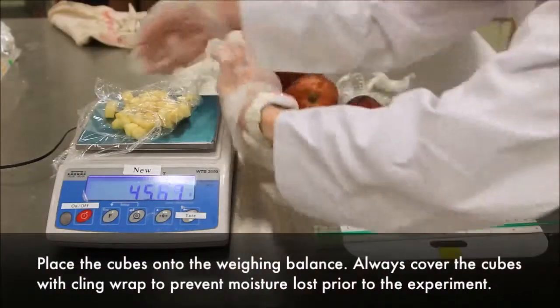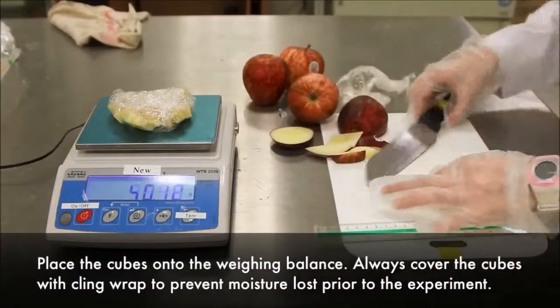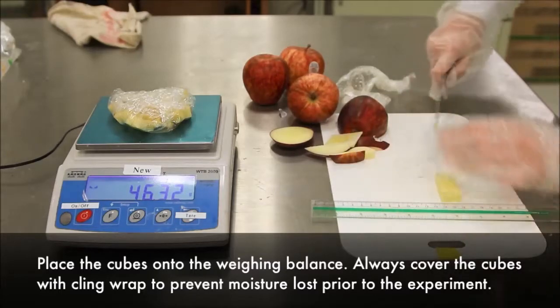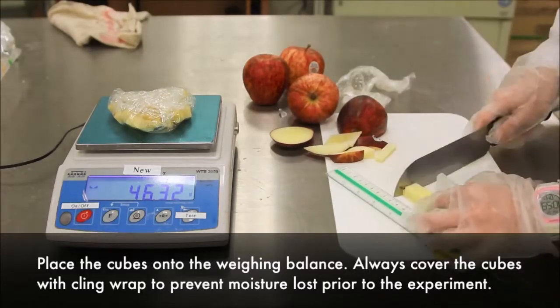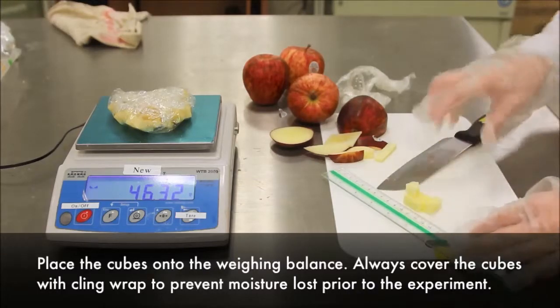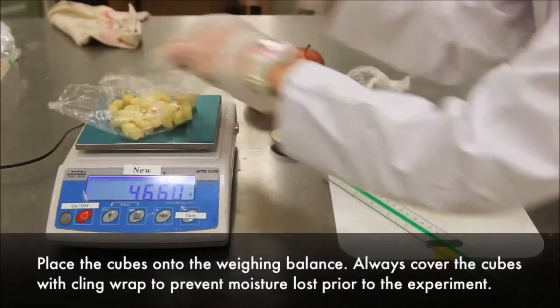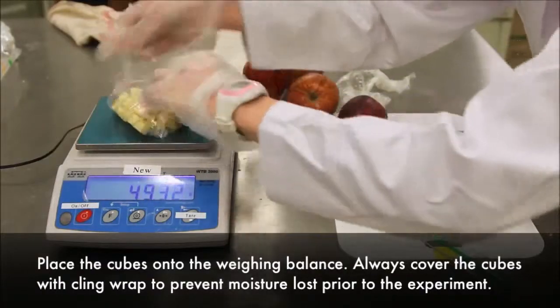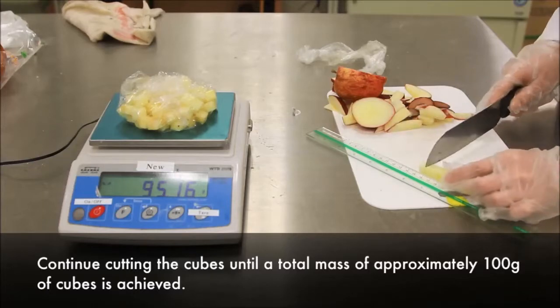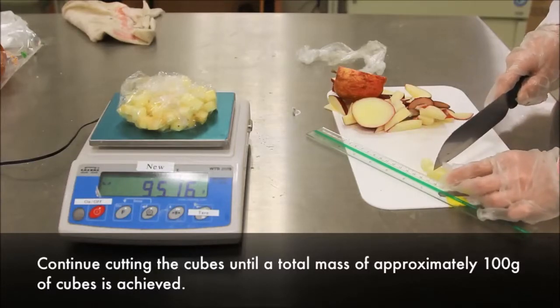Place the cubes onto the weighing balance. Always cover the cubes with cling wrap to prevent moisture loss prior to the experiment. Continue cutting the cubes until a total mass of approximately 100 grams of cubes is achieved.